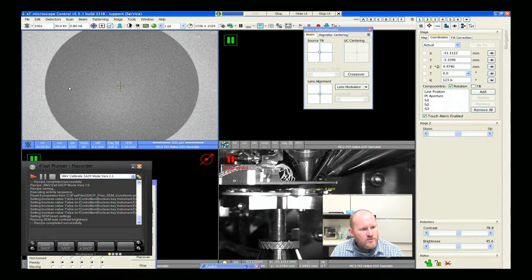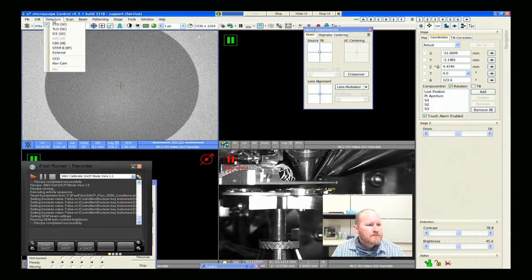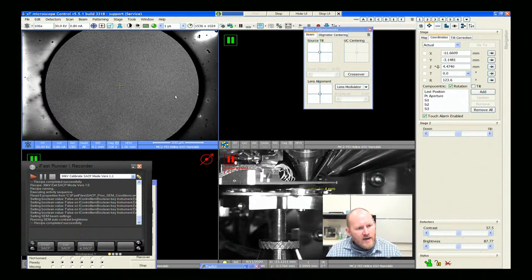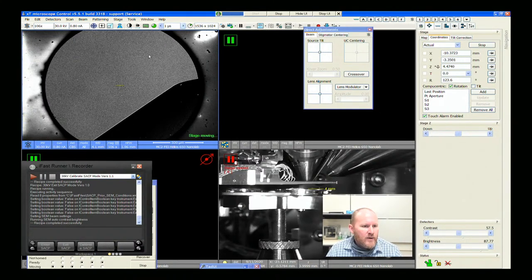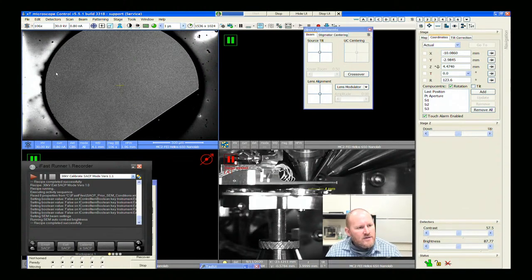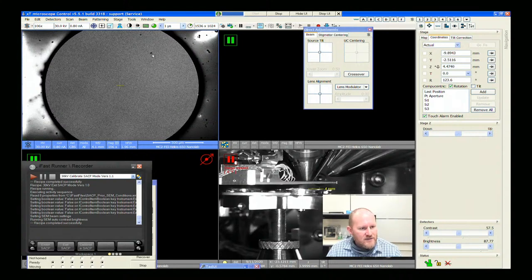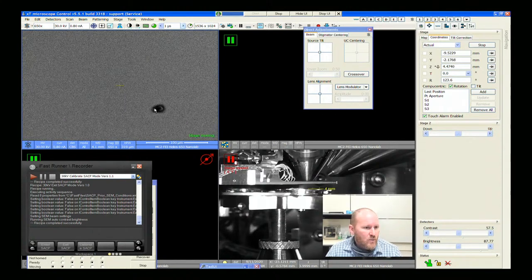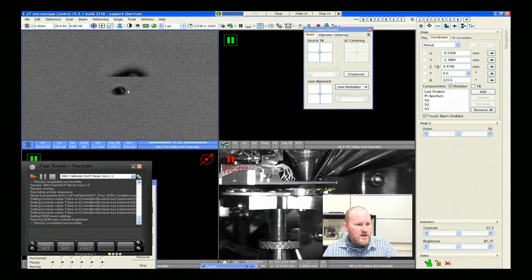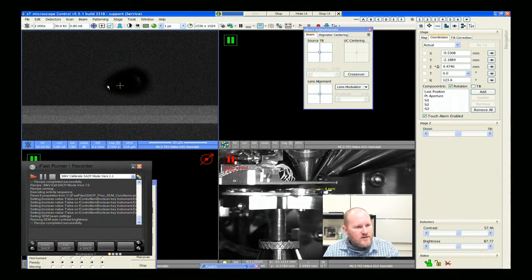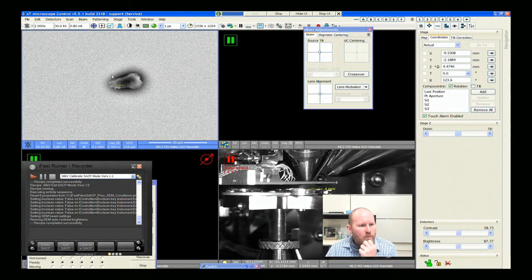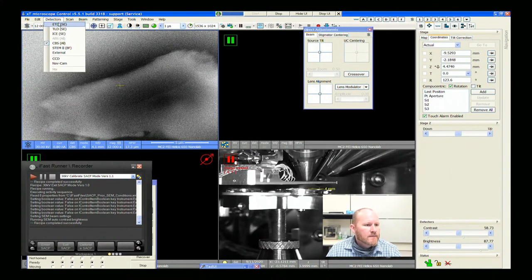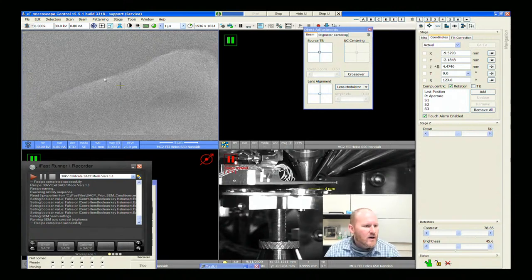True meaning you can always just tilt the stage and try to find a highly channeling condition, but with SACP you know the true crystal directions. You can satisfy some of the g·b requirements because effectively right where your dislocation lines up with the crystal direction, it's not going to give any channeling contrast — that's the g·b equals zero condition. So what we can do is take say two images or four images at different crystal directions and do more than just imaging of dislocations.